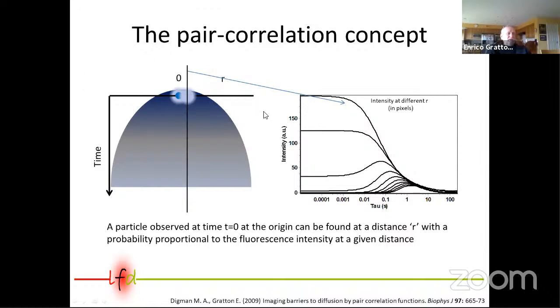So in this graph, I plot not really the correlation function. It looks like a correlation function, but I plot the product of the intensity of a point with the point at a given distance. So if the points have a very small distance, I will get some correlation, even at very short time. If a point is at a long distance, I will never get a correlation. So it has to be 0, or actually, as we will see in a minute, it will be below 0.